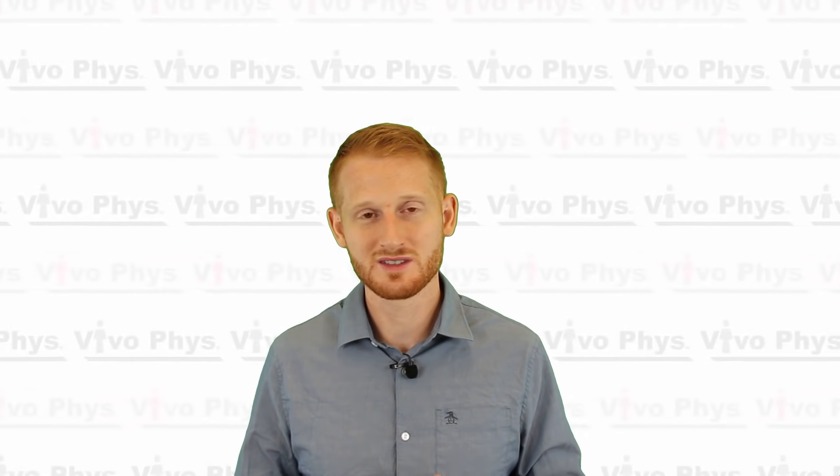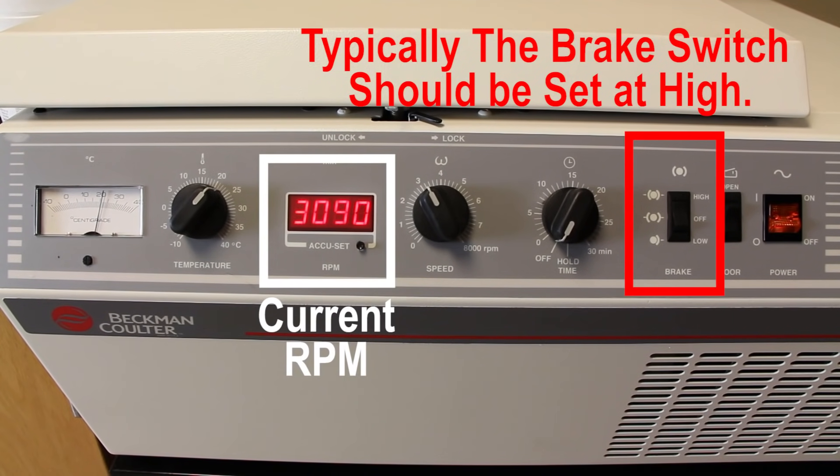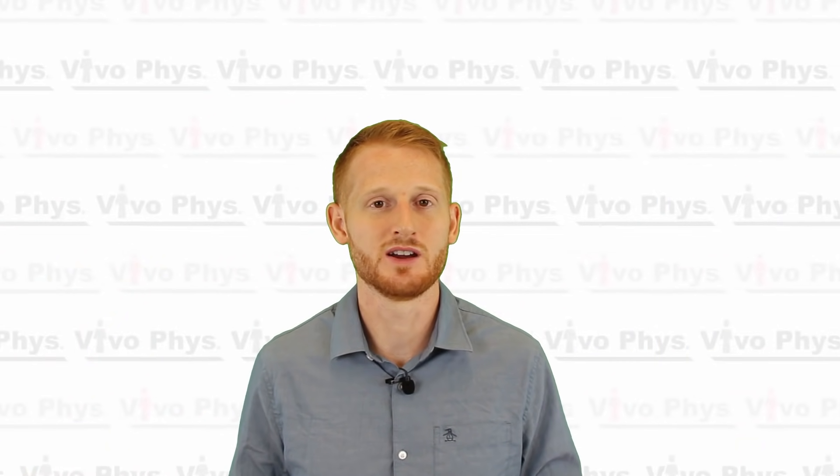Once the centrifuge is done, it's going to start to brake itself if you have the brake applied. You can see that the RPMs are going to slow down fairly quickly. If you don't have the brake applied, it takes a very long time for the centrifuge to stop.